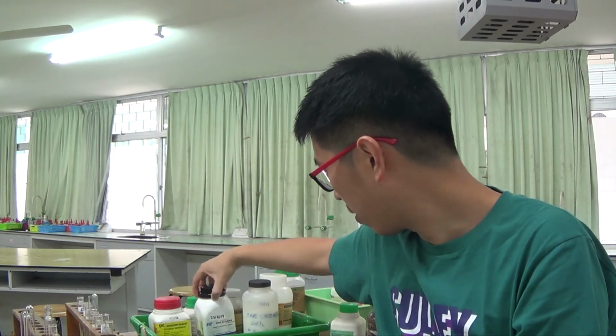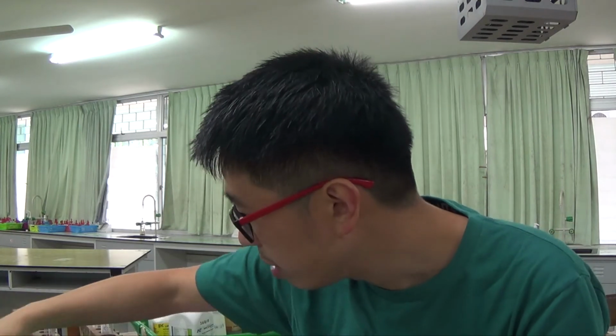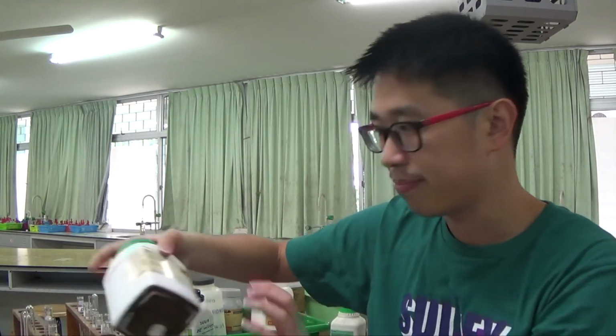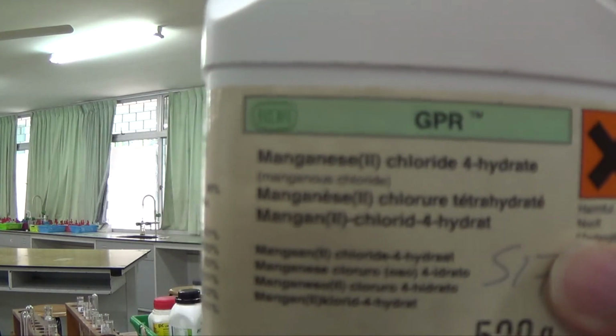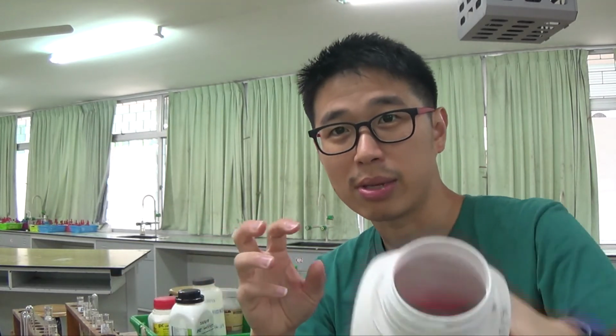What I want to test, however, is this thing called manganese 2 chloride. I swear I had it earlier. This thing, manganese 2 chloride tetrahydrate. So it looks like a pink color solid. When MnO4- acts as an oxidizing agent, you're supposed to get Mn2+. That's the usual redox equation that you write, and that pink color Mn2+ is supposed to be this in aqueous solution. But when we are dealing with solution chemistry, the concentration might be too low that sometimes it appears colorless.